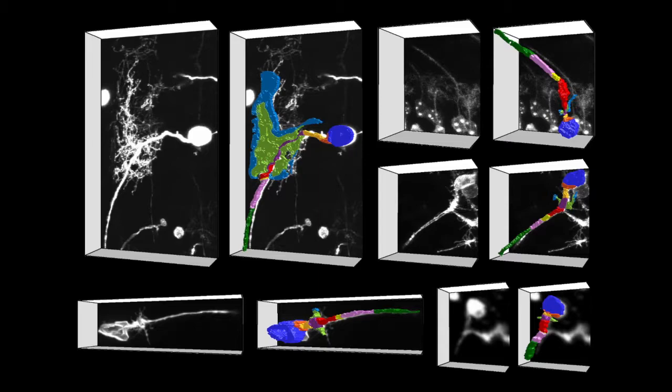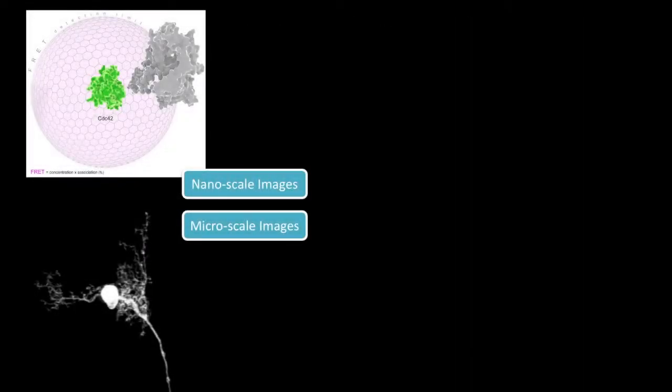Therefore, removing any of these components will reduce the accuracy of partwise segmentation. Here we show one possible application of our simultaneous registration and segmentation method for solving the partwise segmentation problem with artificial template.